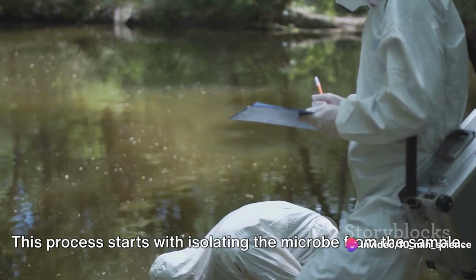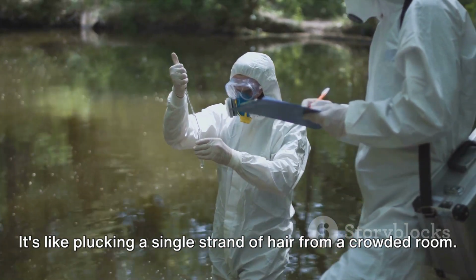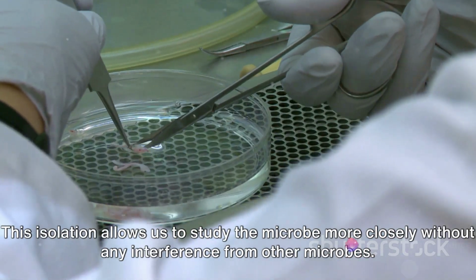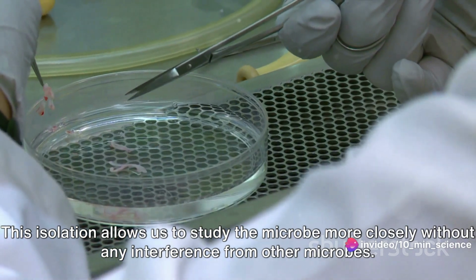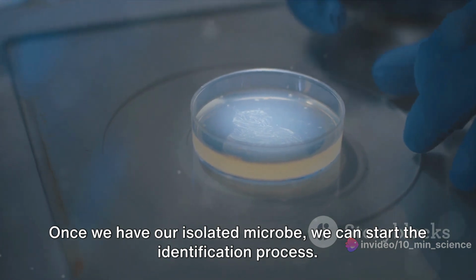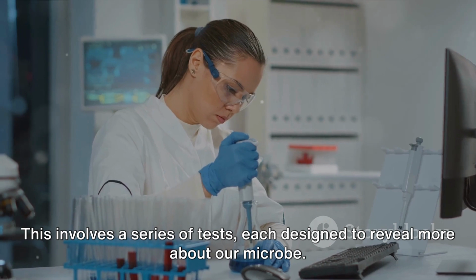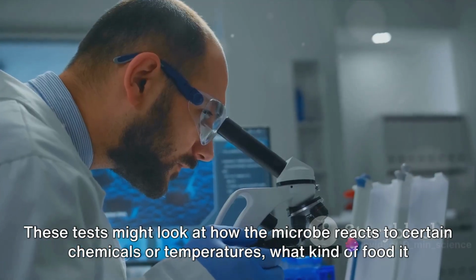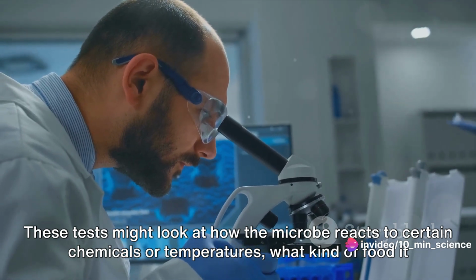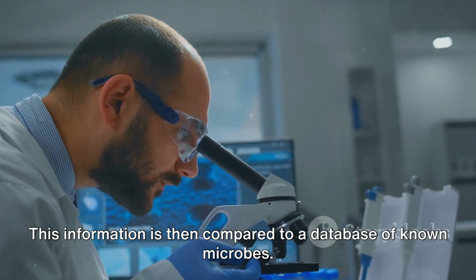This process starts with isolating the microbe from the sample. It's like plucking a single strand of hair from a crowded room. This isolation allows us to study the microbe more closely without any interference from other microbes. Once we have our isolated microbe, we can start the identification process. This involves a series of tests, each designed to reveal more about our microbe. These tests might look at how the microbe reacts to certain chemicals or temperatures, what kind of food it prefers, or even what color it turns a specific test medium.